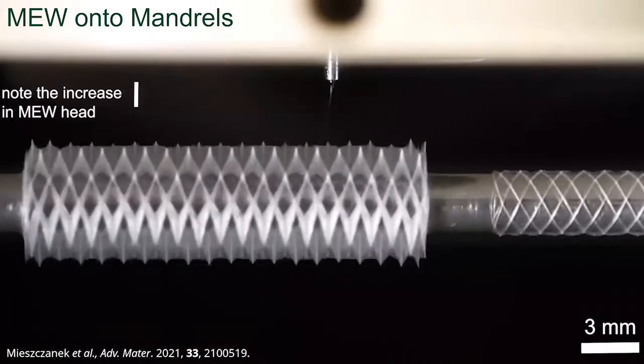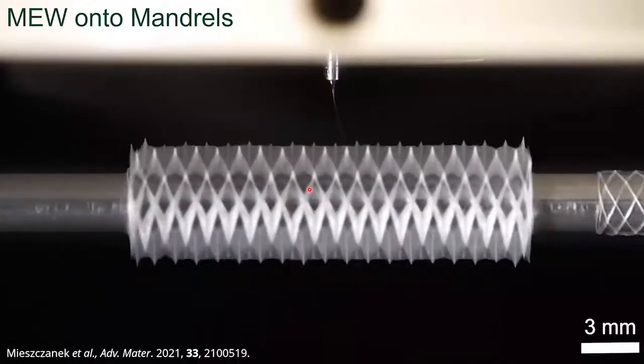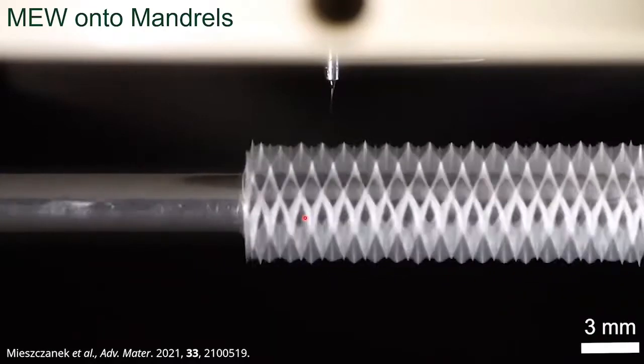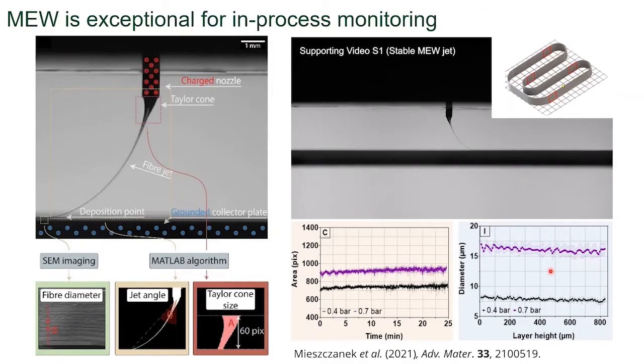Melt electrowriting is not just possible on flat collectors, but also onto a mandrel. For this type of print, you have to precisely calculate the fiber positioning for the winding angle, the mandrel diameter, as well as its length. And the visual access to important information in real time is some of the best for any 3D printing technology.